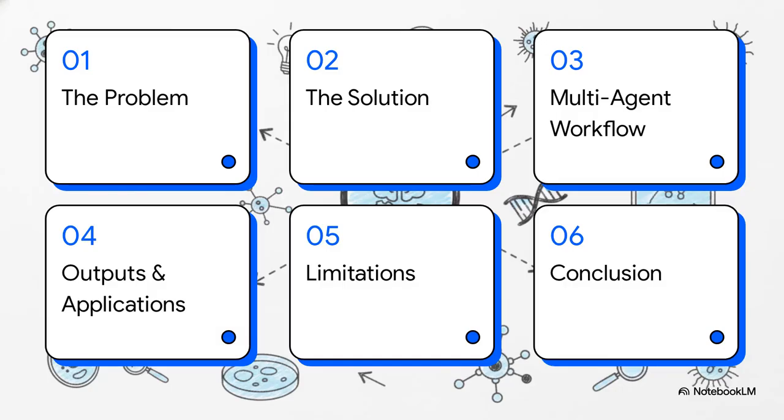Here is our agenda. We'll cover 1. The problem, 2. The ProteoMind AI solution, 3. The multi-agent workflow, 4. Outputs and applications, 5. Limitations, and finally, 6. The conclusion.